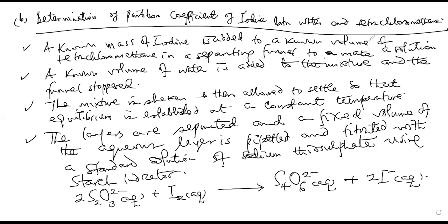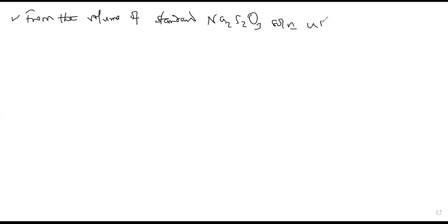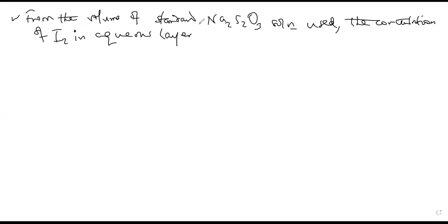So we are going to say, from the volume of standard sodium thiosulfate solution used, the concentration of iodine in the aqueous layer is determined.